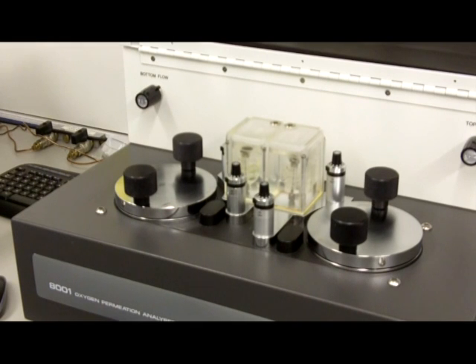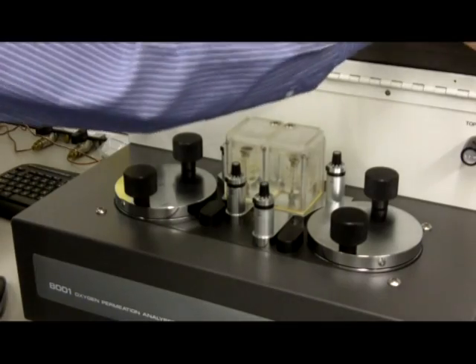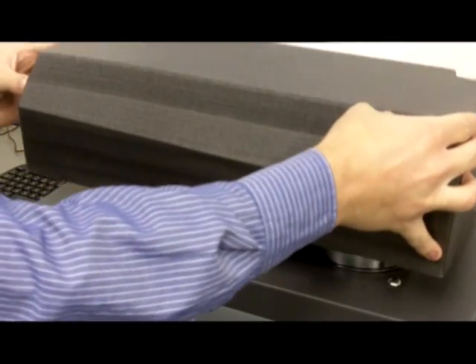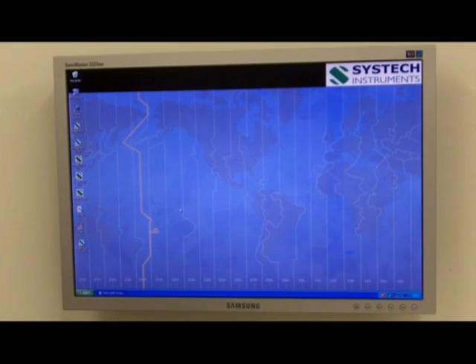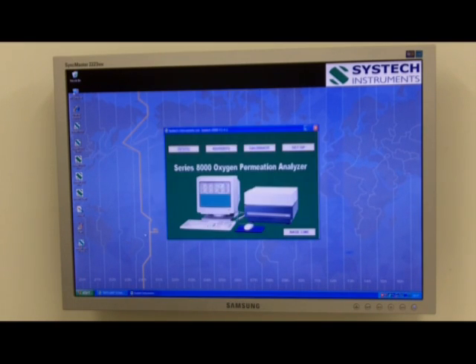Close cover, then go to Windows computer screen to start test. Now go to the simple Windows screen and enter the parameters that you want for your tests.